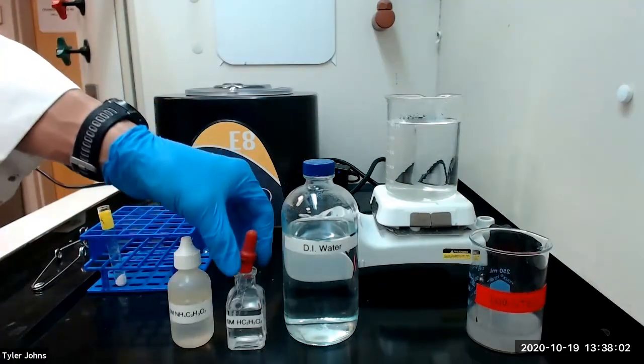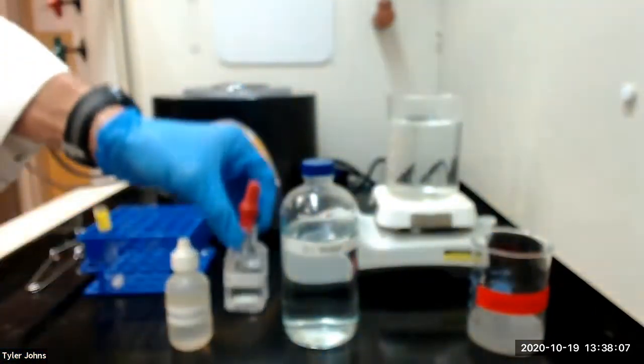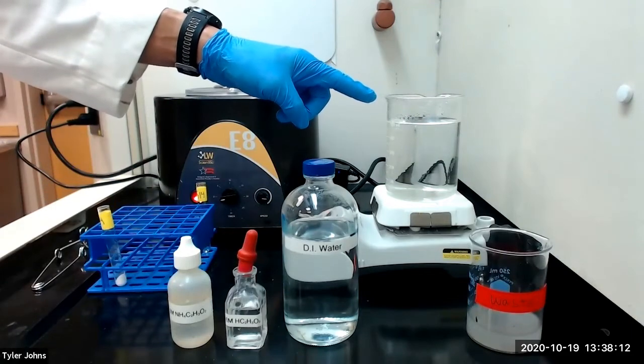We will next add five drops of six molar acetic acid to our residue R14. We will warm in a hot water bath to dissolve the carbonates.